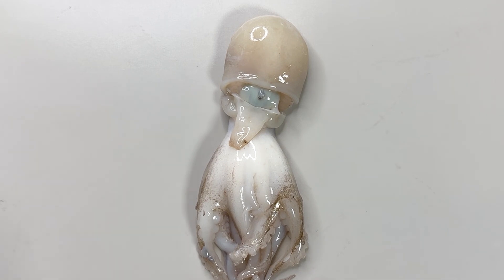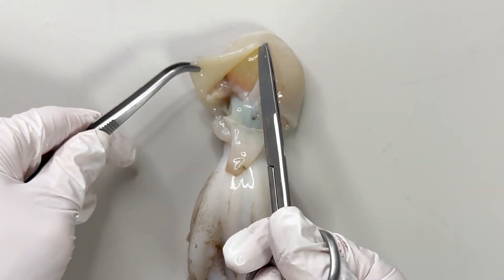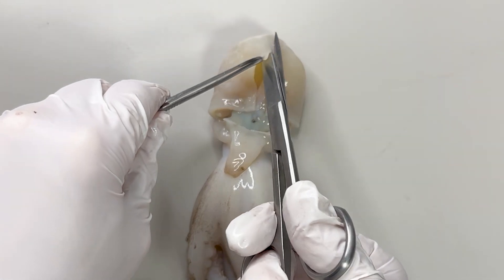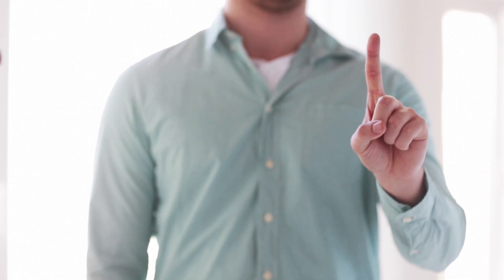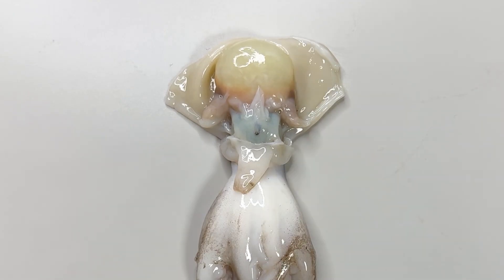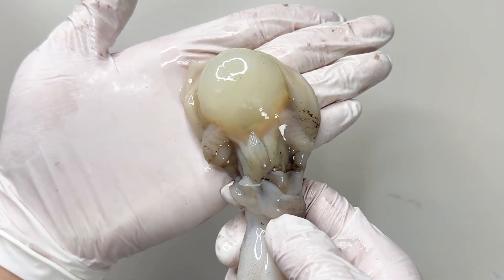Now let's take a close look at the inside of the webfoot octopus's body. Cut down the center of the back of the body, open it up, and it looks like this inside. But today we'll focus on one part only — right here: the large round organ packed inside the body. This is a reproductive gland.